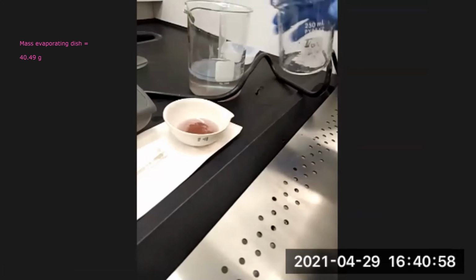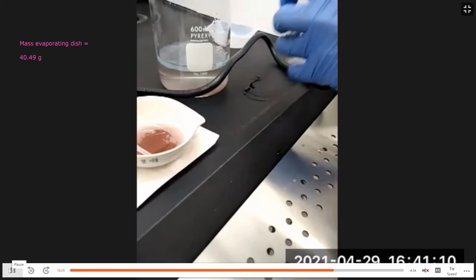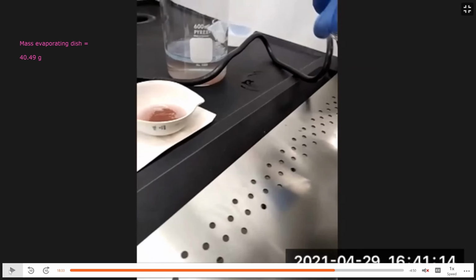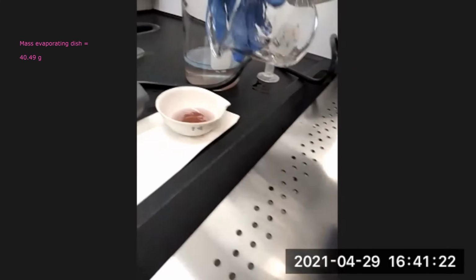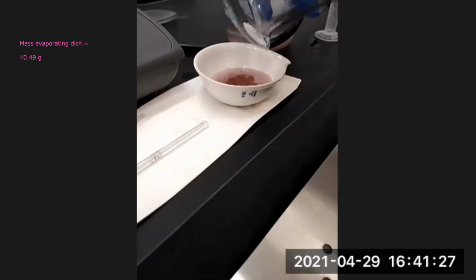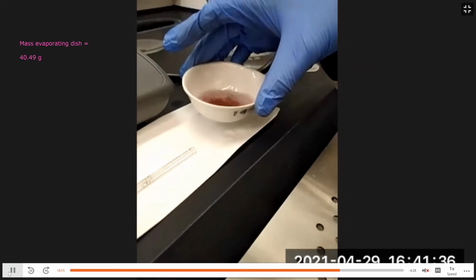Now all of the copper has been transferred to the evaporating dish. Again, we're going to have to remove the solution that's still in the evaporating dish with a dropper and then place the copper in the oven to dry it. You're using like 5 milliliter portions of methanol or acetone, whichever one's available, to wash the copper. Washing is extremely important.